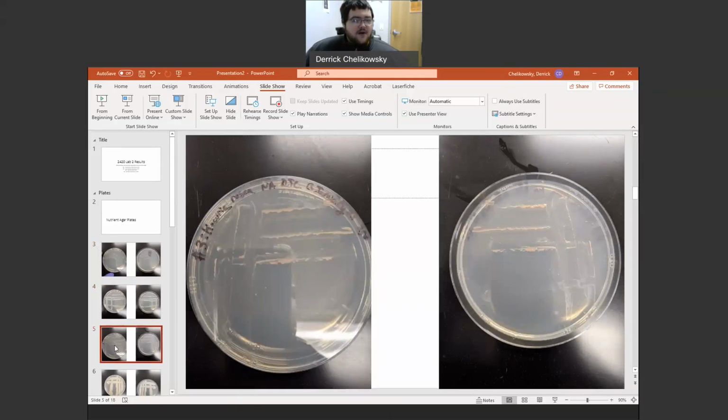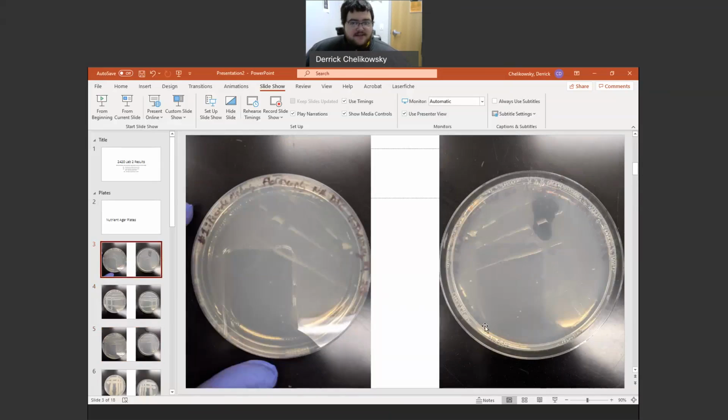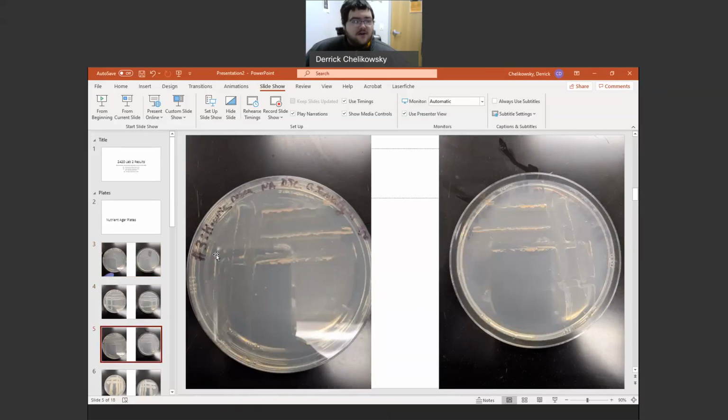The best way to describe it is with the Pseudomonas fluorescens. You're getting some growth here, but not a lot. Do the best. Now, if we take a look here at the Kocuria, same thing, 3 here, 2, 1. There would be growth over here. Later on in the semester, I'll show you a very good isolation streak. It'll probably be a quad streak. That'll show you exactly what you're looking for, but we don't have those growing at the moment.